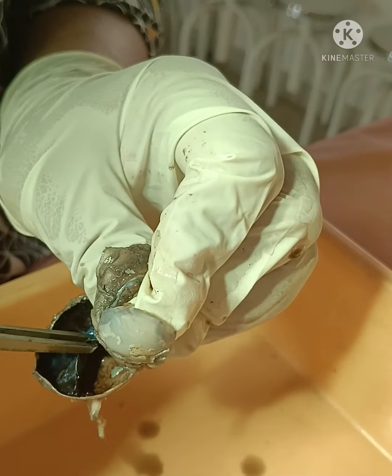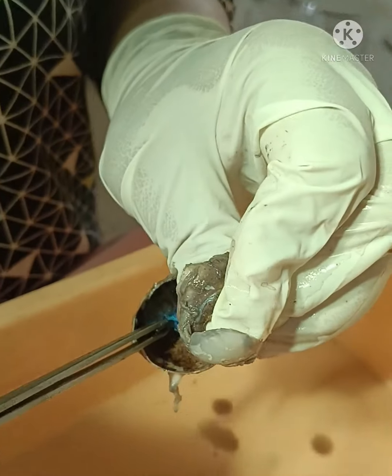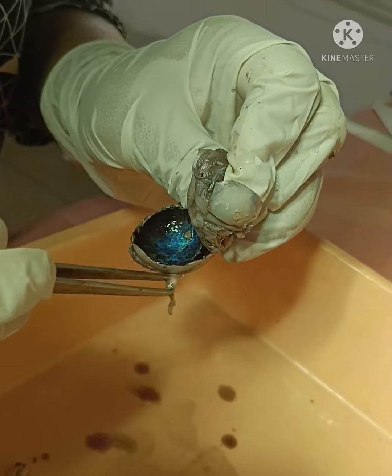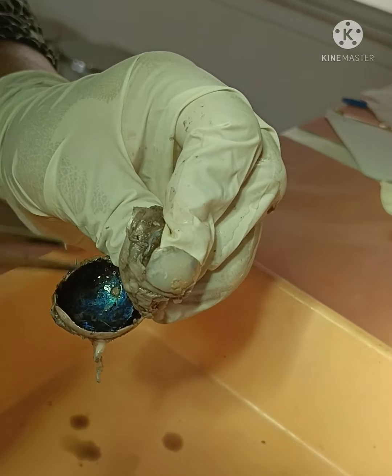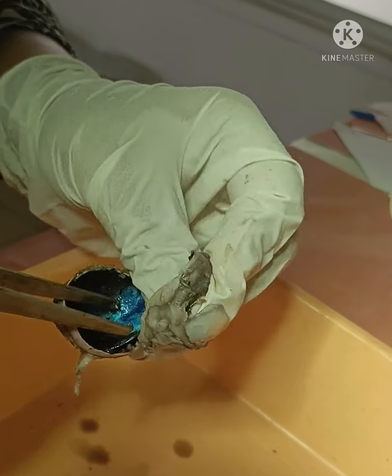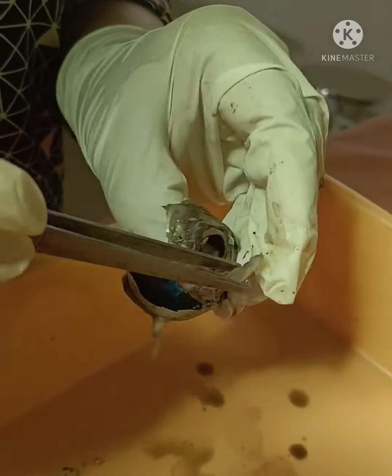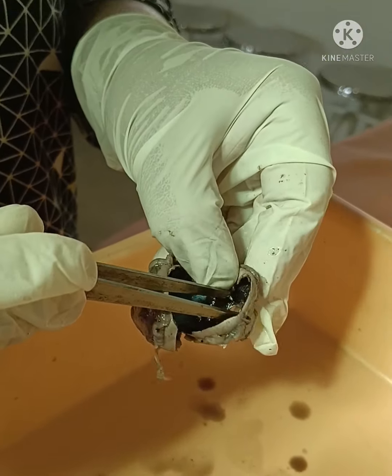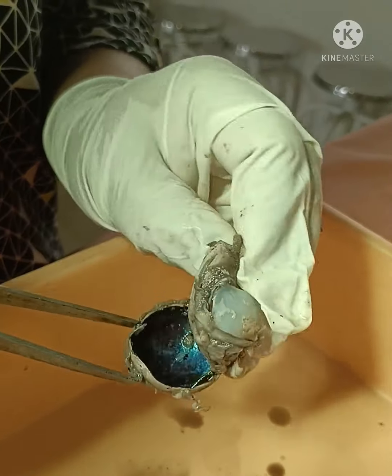This layer is the choroid and retina together, and this outer layer is the sclera. So from outside to inner side: sclera, choroid, and retina. Anteriorly you can see the cornea, the pupil, the iris, and the ciliary body. So these are the structures of the eyeball.